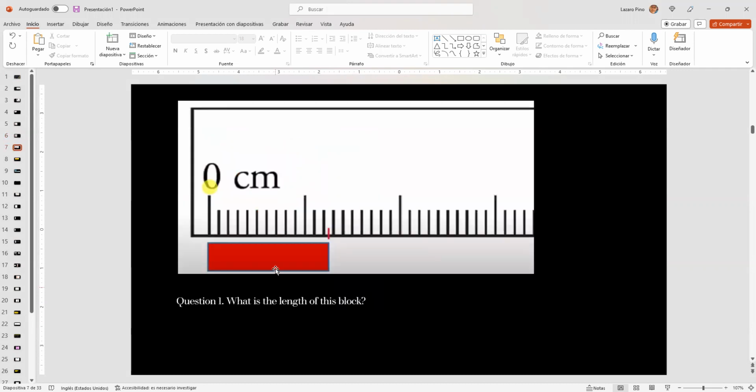Okay, here you have question number 1. You can stop the video at any time, and you can do the measurement and write it in your notebook. Later, at the end of this video, I am going to give you the way you are going to report your answers.